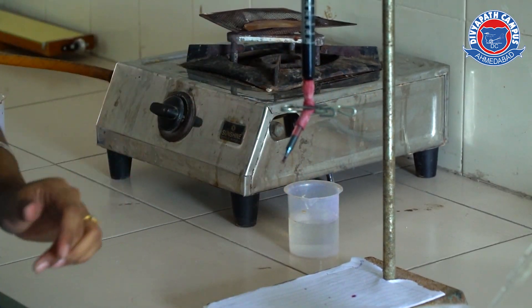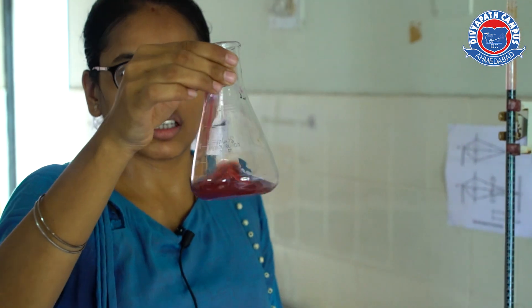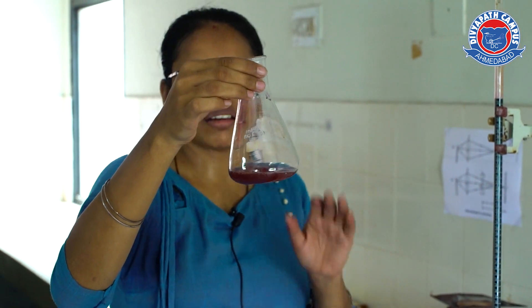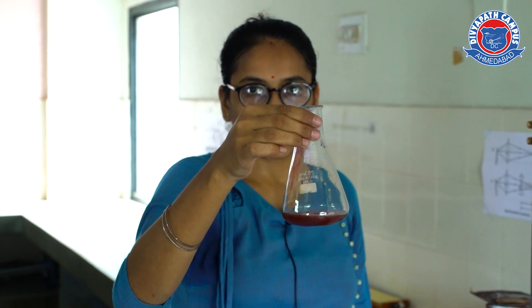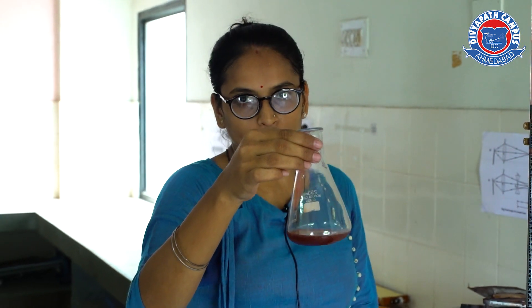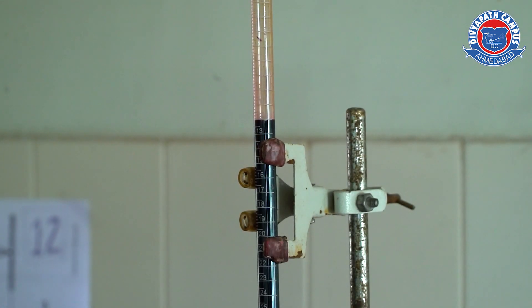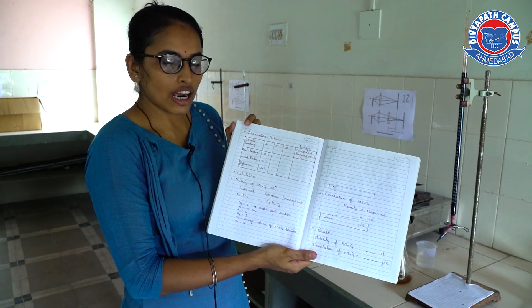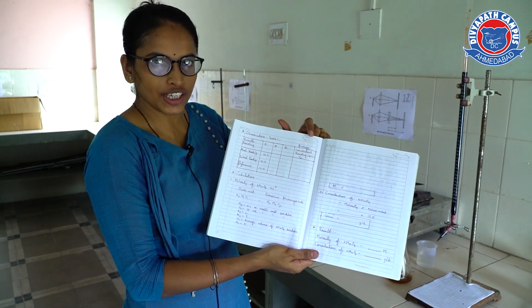Now you can see the color of the solution has changed and it remains persistent — it is not disappearing. So this is our end point. The reading of the burette is near about 12. After titration, after taking 3 consecutive readings, we have to put the values inside the observation table.